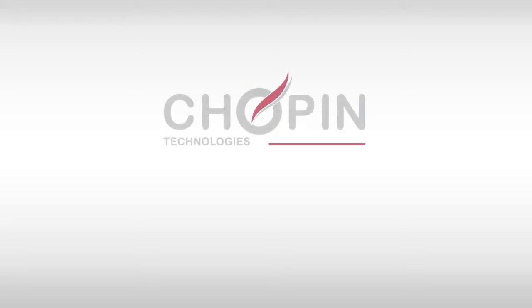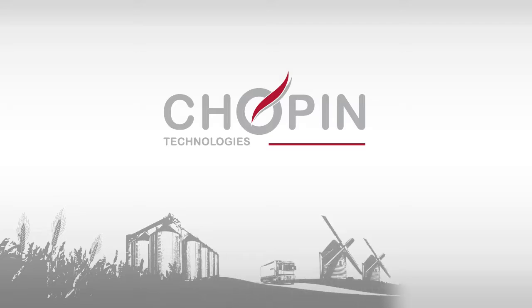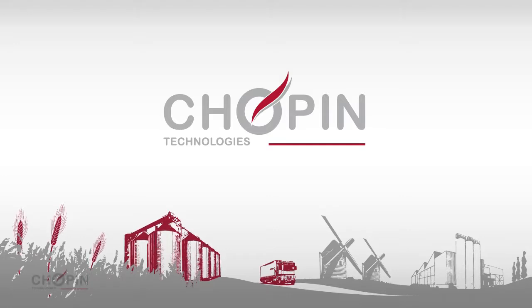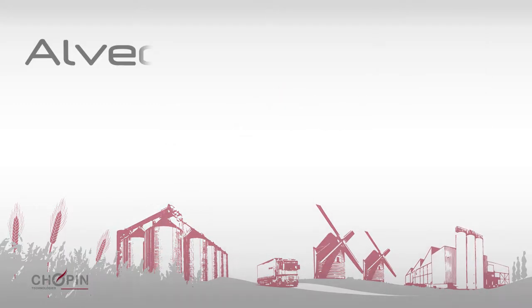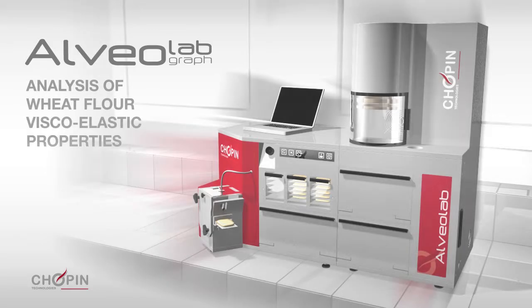For almost a century, Chopin Technologies has focused on providing the cereal industry with quality control tools and methods. Wheat breeding, grain storage, milling, and baking industries use the AlveoLAB on a daily basis to measure the viscoelastic properties of wheat flours.